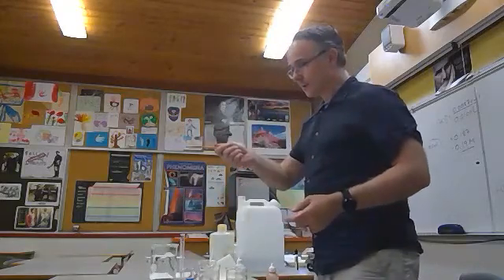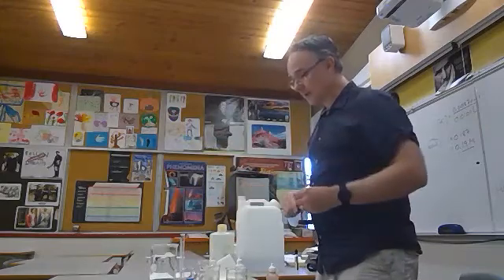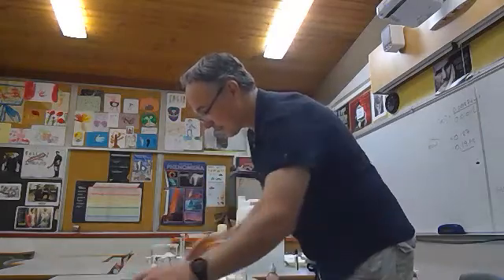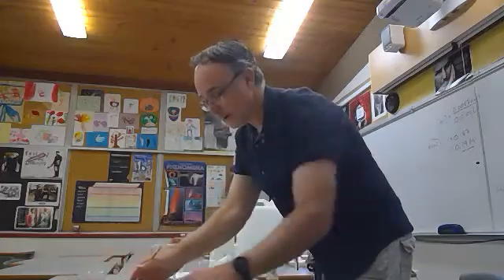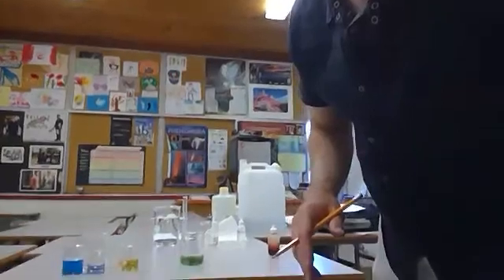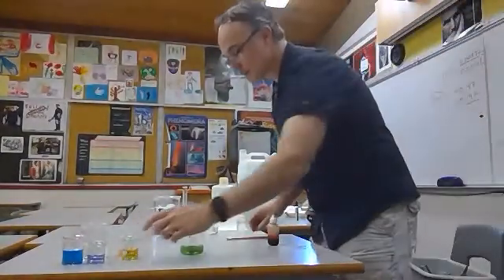So we've shown titrations. We've shown how indicators work, the general gist of that. And there's lots of videos on the math of how that works. The last thing I was going to look at was a buffer system. Sorry guys, watching there, you can't see the color. So this is still the acid.